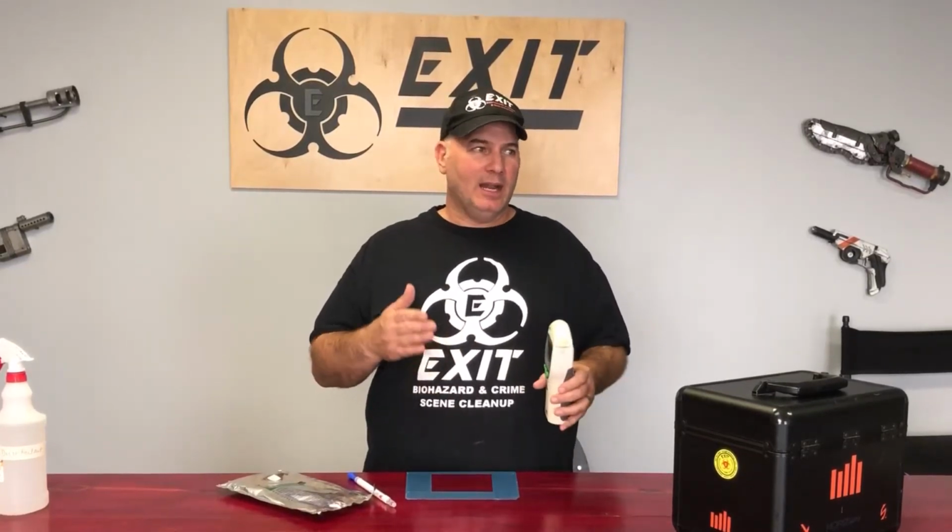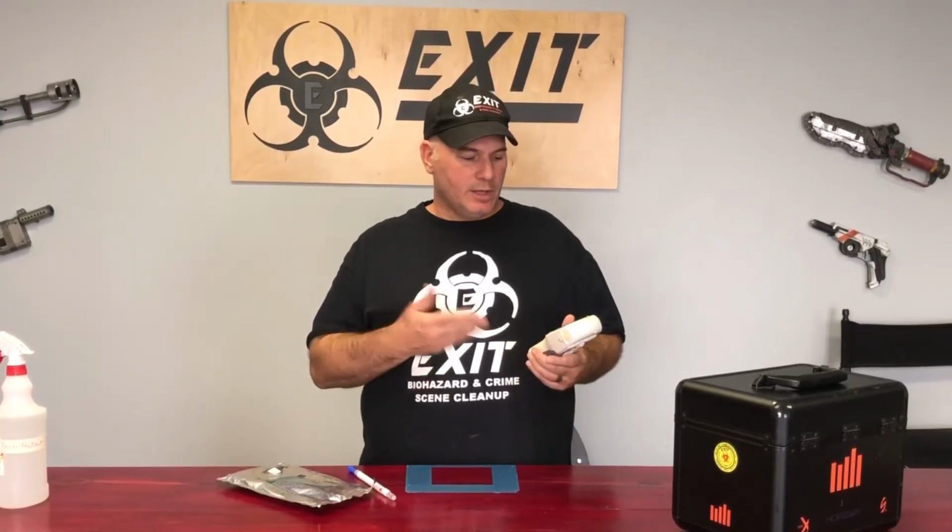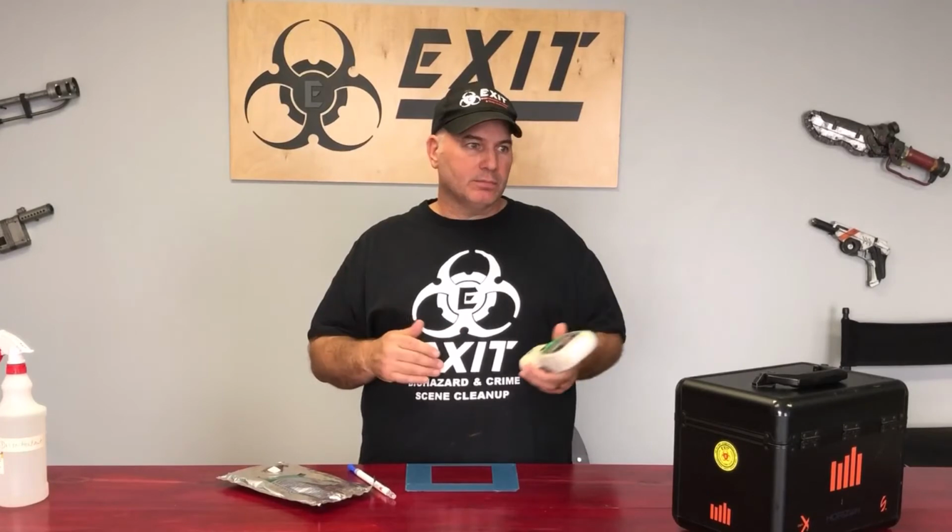For Hygiena, I think anything under 10 is pass, anything over 30, I believe, is fail, and then in between is caution. Might need some more scrubbing in there. But anyway, for our purposes, we're going to say 250 and below is clean. Anything below 500 is cautionary, and everything above that is a fail.